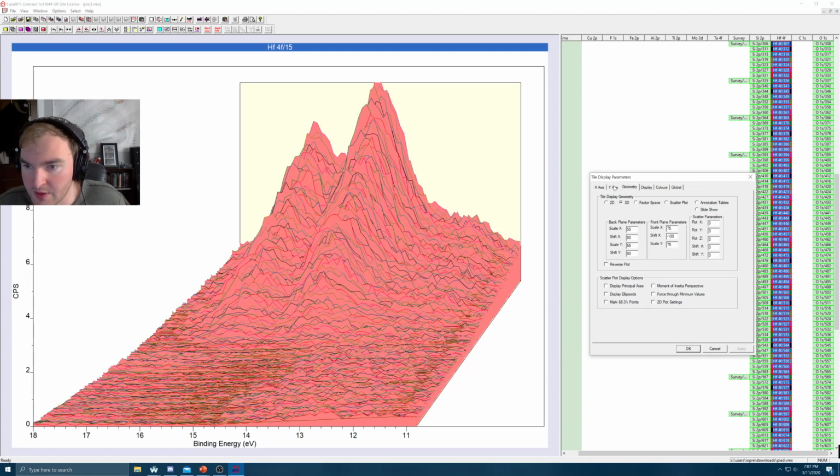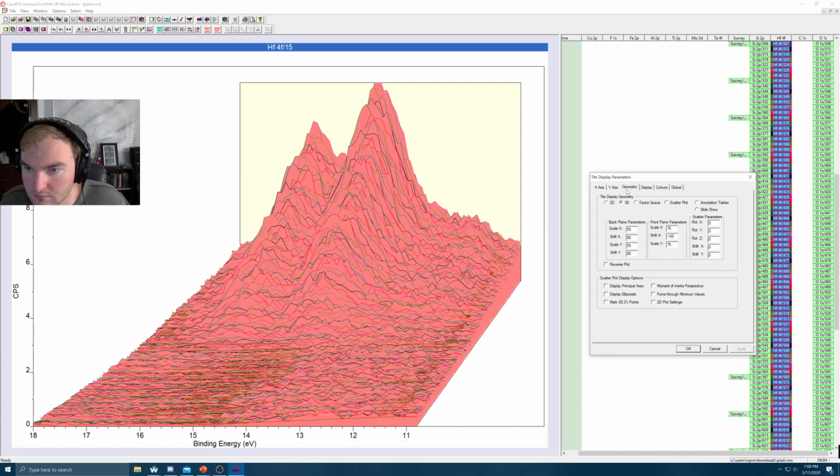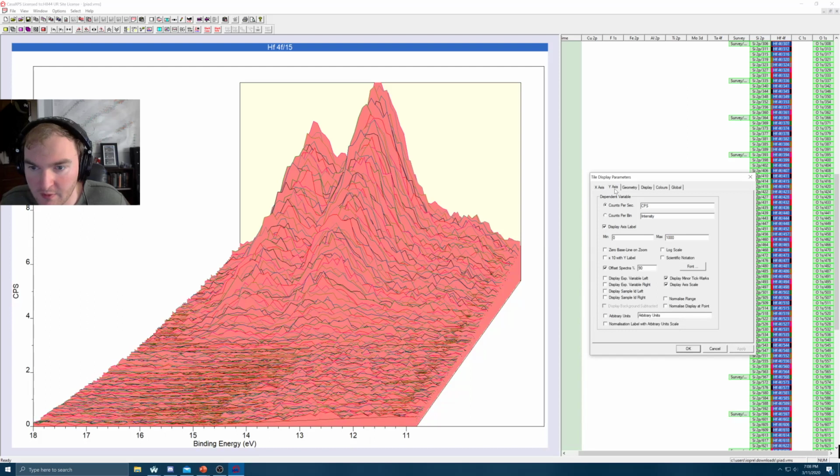one other thing that you can do that is useful, and bear with me while I recall, is that you can offset your spectra to different degrees. That is not how we do that. That's not what I want. Alright, so off the top of my head I can't remember how to do that, so maybe I'll make a separate video for that.